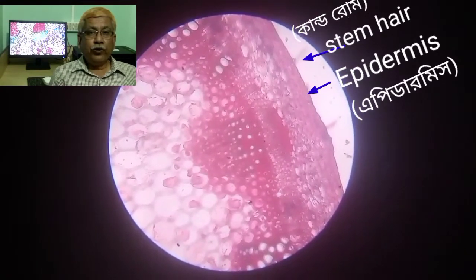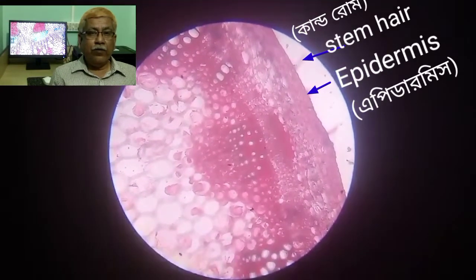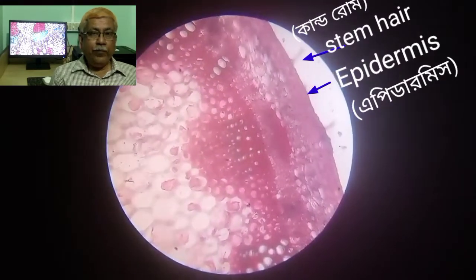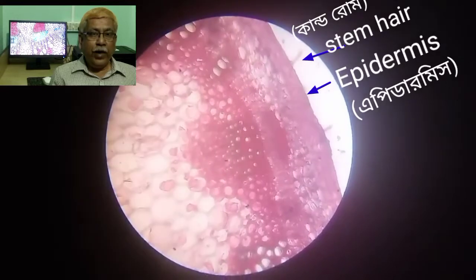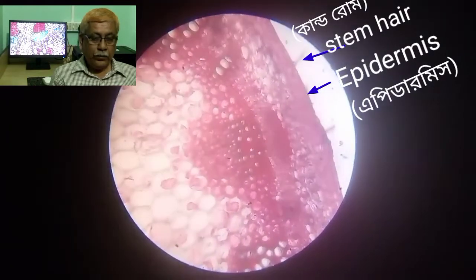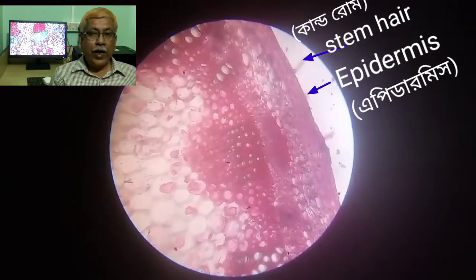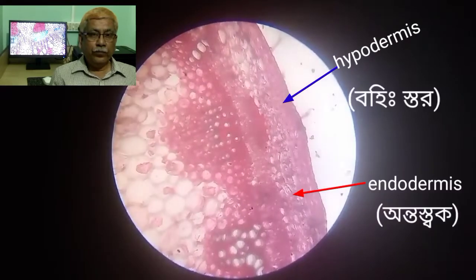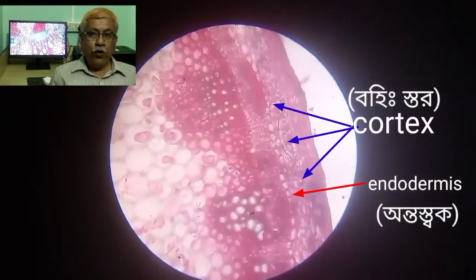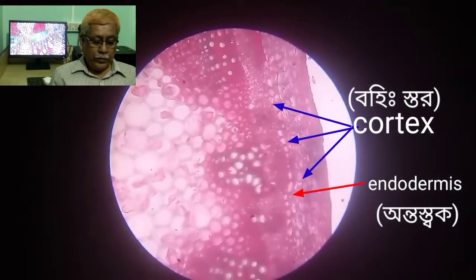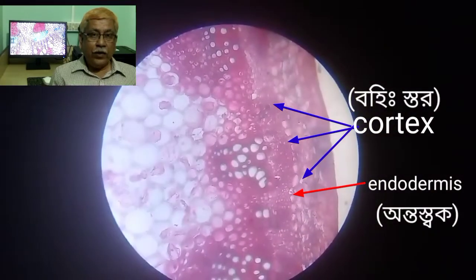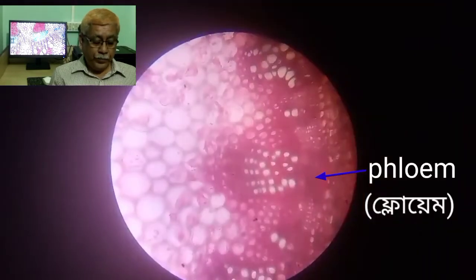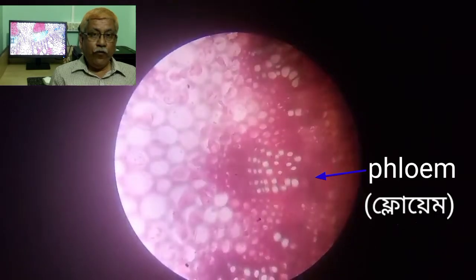TS of a portion of dicot stem — sunflower stem — under low power of the microscope. The stem is visible here and epidermis is clearly visible. Look at the slide. Hypodermis, endodermis, and cortex — these regions are clearly visible.